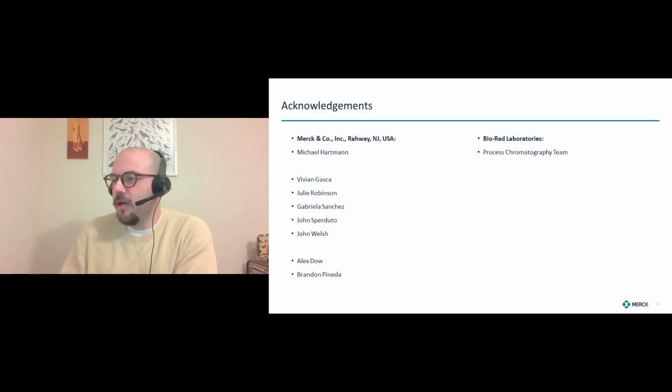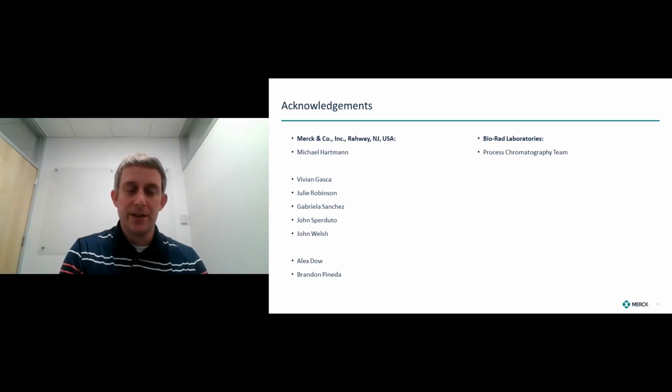Sure. Great. So this last one will read, it seems the ligand charge across the pH range in wPrime gives you more workspace for your DOE than a strong AEX. Is that true? Yeah, I think that's definitely fair to say, especially looking at the pK of the ligand and a lot of the proteins that we're looking to purify and that are of interest. For multimodal DOE, we're always looking at balanced charge and hydrophobicity, but then you're getting more range in charge here.